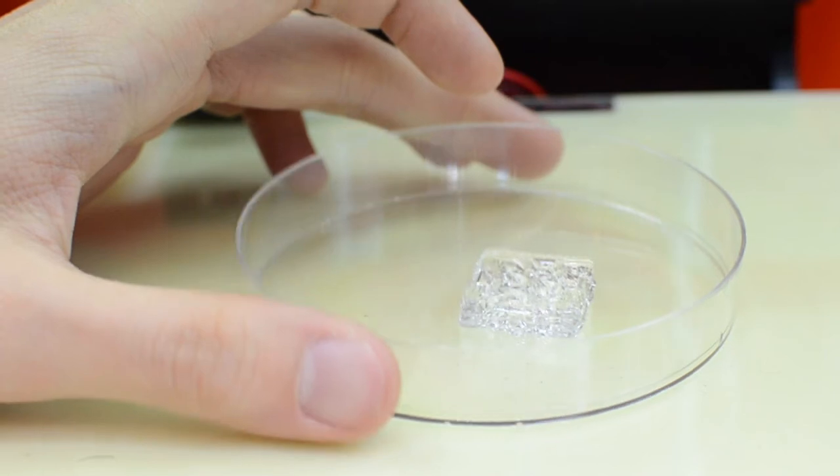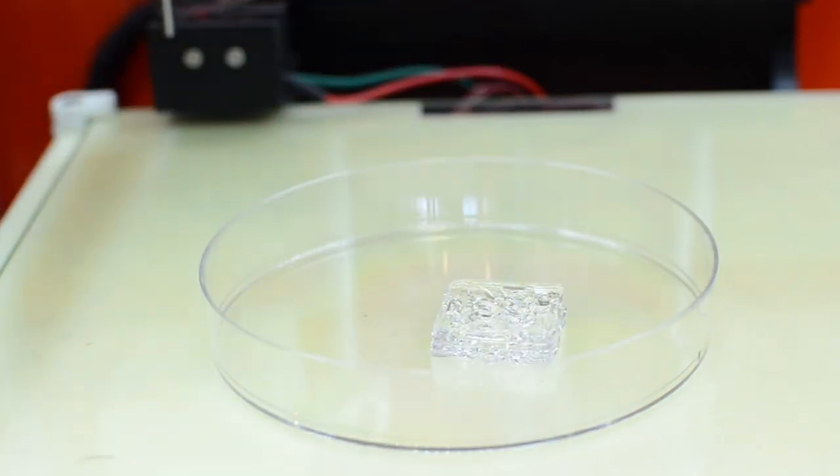Okay, so you can see the scaffold print that we just designed, and as you can see, this material Pluronic is a very printable material. So it's definitely one of the very commonly used biomaterials in the tissue engineering community. So any questions so far?